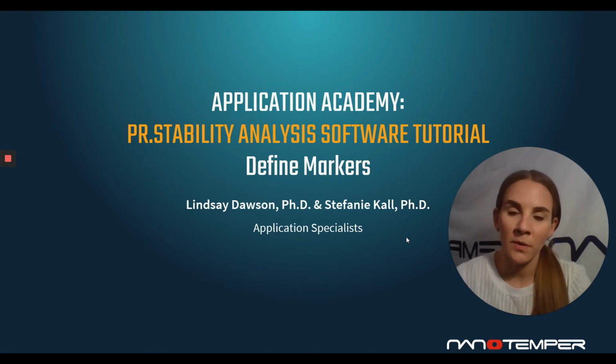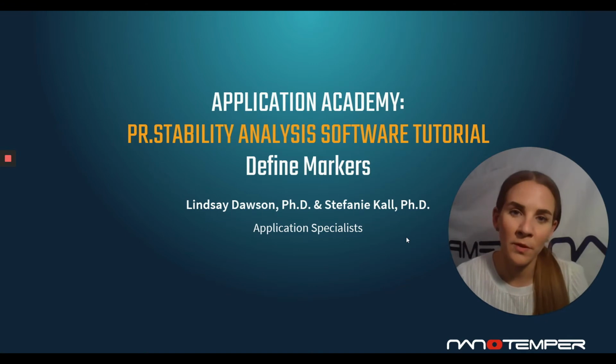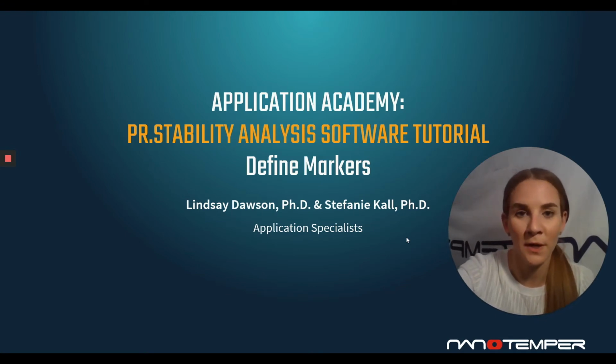So I'd also like to add that if you do carry out any additional analysis in, say, the ThermControl or ChemControl softwares, any of those annotations are automatically imported into the PR.StabilityAnalysis software, so none of your work will be lost. All right, so without further ado, let's go ahead and jump into the software for an example of defining markers.